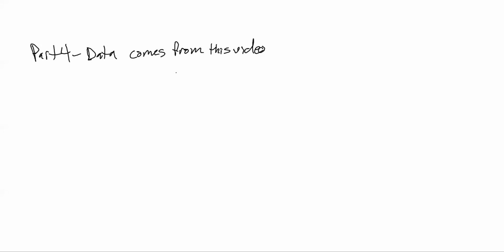So in part 4, what it says is that we're going to take a test tube, and one of them is going to be our FeCl3, and we're going to mix that with KBr and KI separately. That's what we see there in our videos. Now, the part that I'll tell you is that when you mix them, this is our FeCl3.